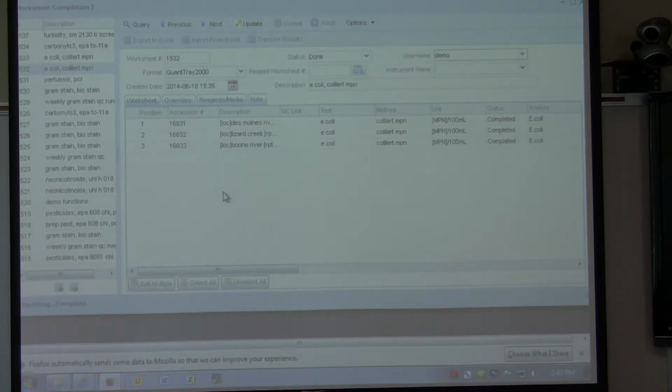Most of our screens say, if you're in the middle of a commit, hey, you're trying to close the window, you haven't committed yet. Now, if you reboot your computer, it will not save. You have lost it. Same if I hit reload on the browser, or in the case where you time out of OpenELIS. If you go somewhere else for 15 or 20 minutes, then yes.